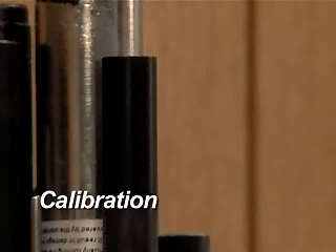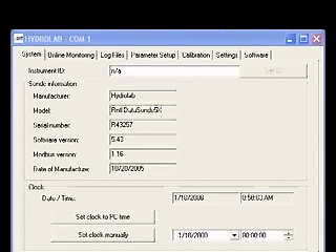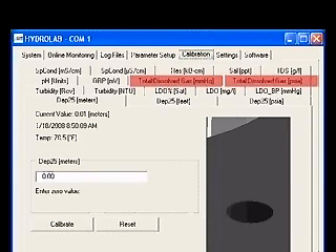If you are going to deploy the unit, it must be calibrated first. Remove the membrane cartridge if it is installed. Establish a connection to the sonde with Hydrus 3LT. Click the button labeled Operate Sonde. When the sonde finishes its initialization, click the Calibration tab. Then click one of the tabs labeled Total Dissolved Gas, measured in either millimeters of mercury or PSIA.